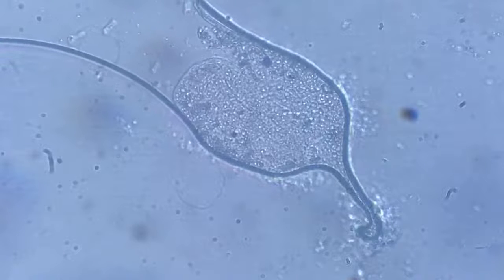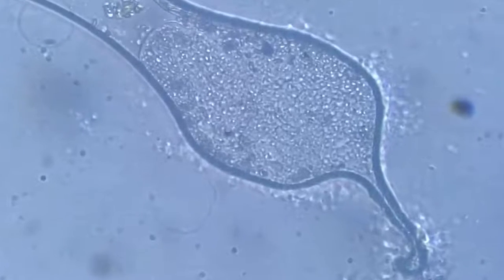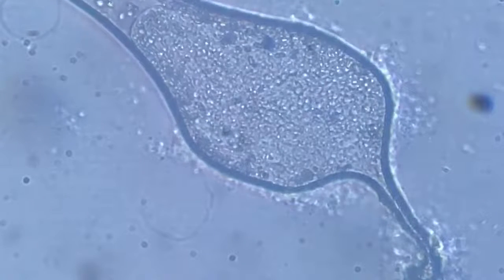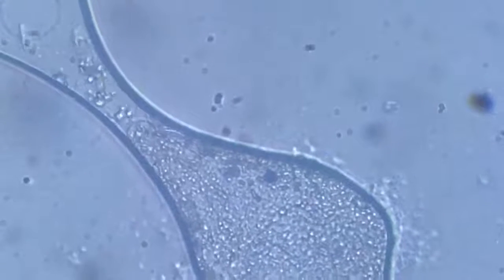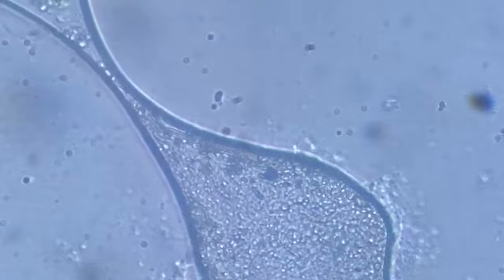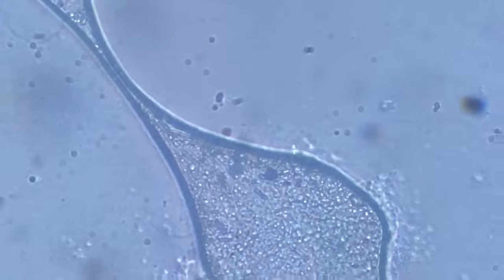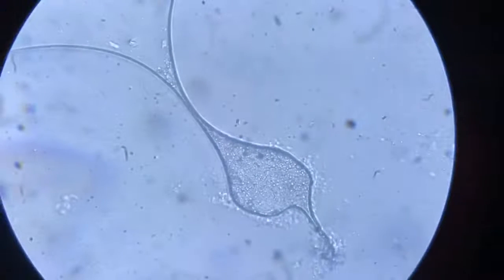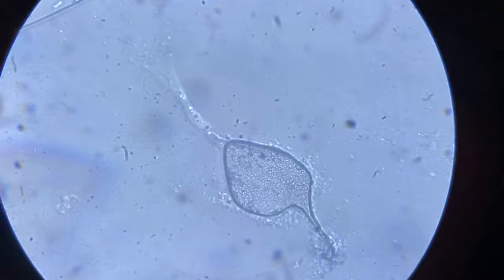There you see what remains out is only the bacteria that it had eaten. That last fragment of the pellicle, and that is crushed out too. Now it will be left off in just a pocket of water here.